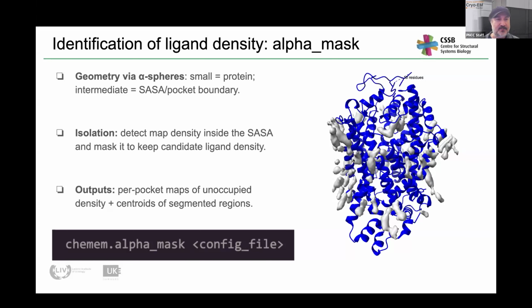And for these searches for multiple conformations, what is the minimum map resolution you might think you need to effectively find them? I have no idea of a concrete answer for this question. So the one case I came across where I did get both conformations, I think the resolution was just over 3, and it was a pretty good just over 3 within the binding site.